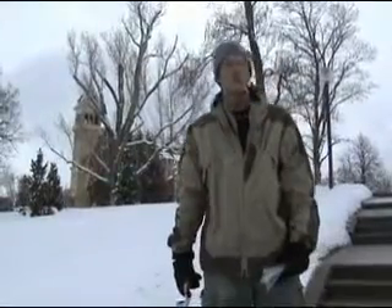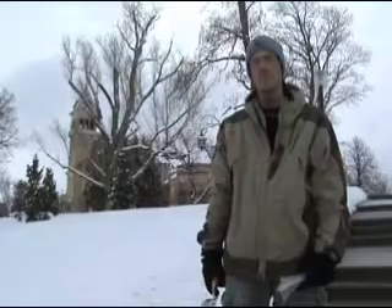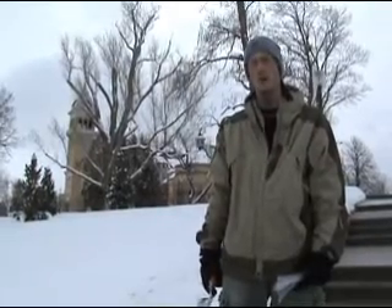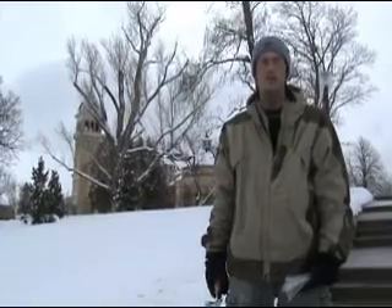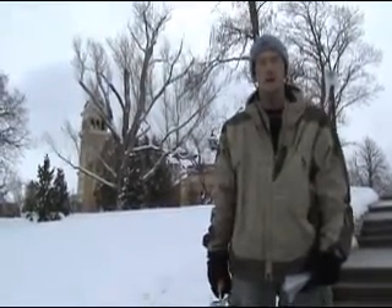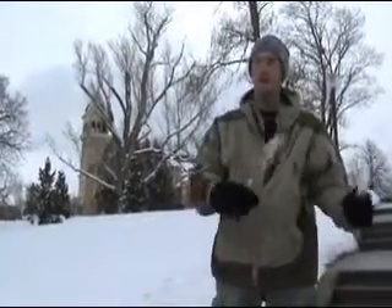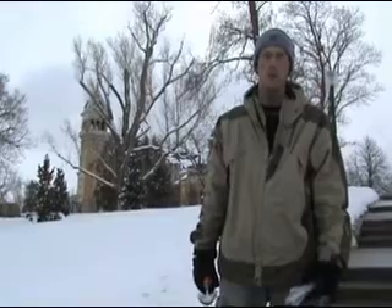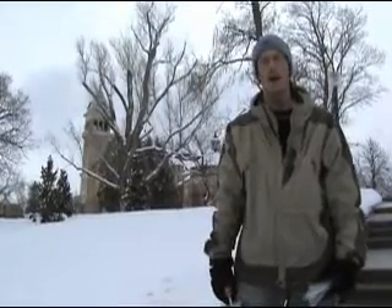We're here in Logan, Utah. Not the best time of the year to be here, but it's been snowing the last few days. We're going to try to collect some soil and see what kind of microorganisms we can find — if we can get any insect pathogens. A lot of times when you think about going into the field to collect soil, you think you have to go into the mountains or the prairie or the desert, but really soil is everywhere. That's the great thing about isolating fungi from soil — you can get it anywhere.